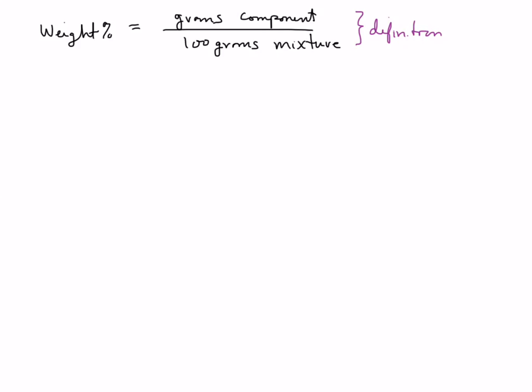Okay, so here's our mixture. You're going to want to separate it into its 3 components. Now, this one's kind of damp, and I bet they all are. I would take a paper towel and wipe it off. It might give you better results, because that moisture can carry throughout your experiment. One of the first things you're going to do with your mixture is to get a weight on your mixture.